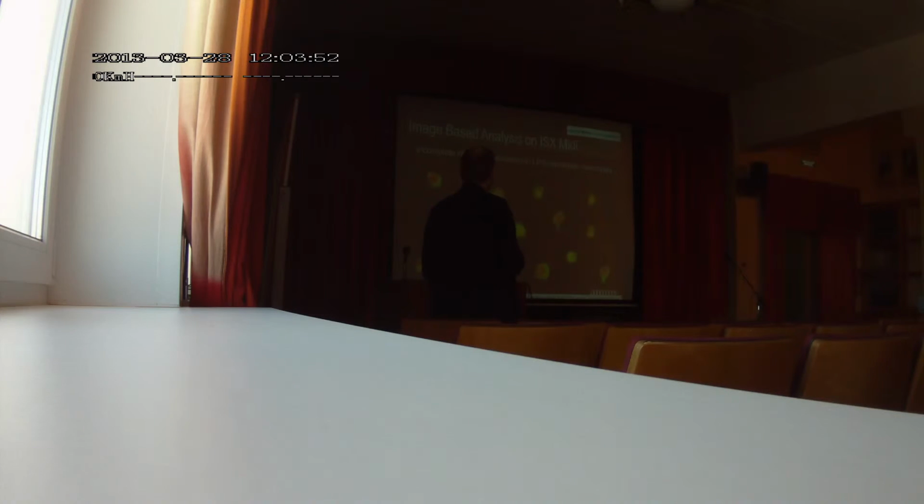In this experiment, we have isolated monocytes, and they are stimulated by lipopolysaccharide, a particle from the bacteria cell wall which induces an immune response in the monocytes. This would be shown as a translocation of nuclear factor kappa B from the cytoplasm into the nucleus to start producing some immune particles and so on.